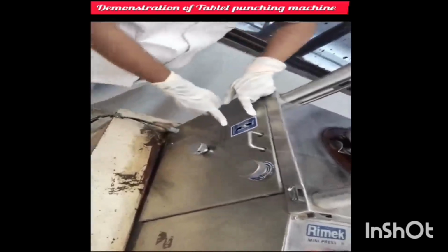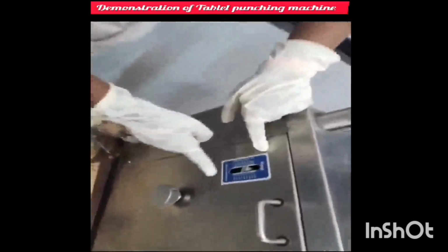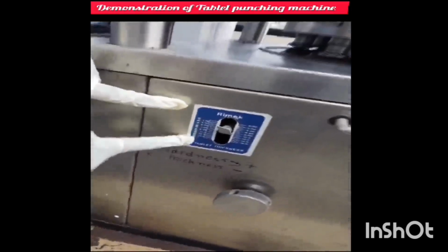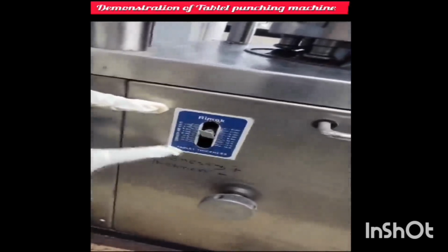So here is one chart that will decide the tablet thickness. By rotating the knob and by dimensions, we can decide what the hardness and what the thickness of it will be.